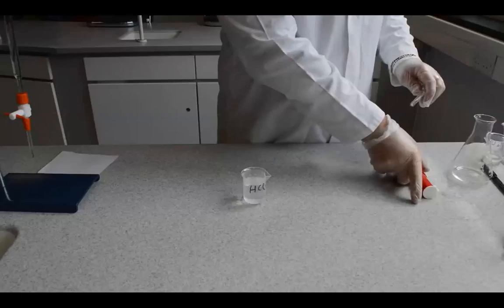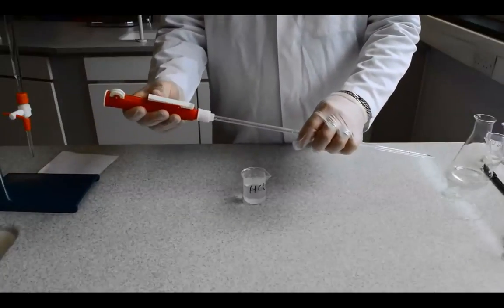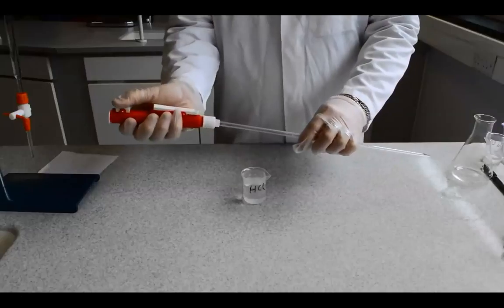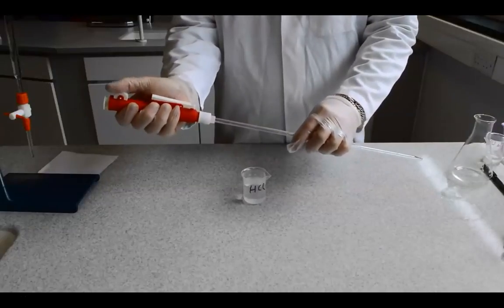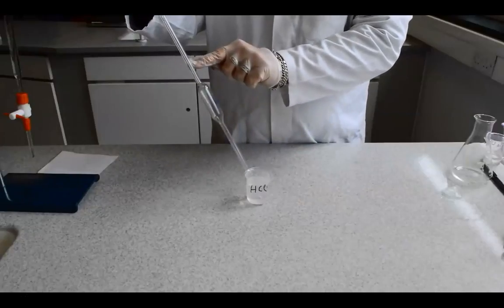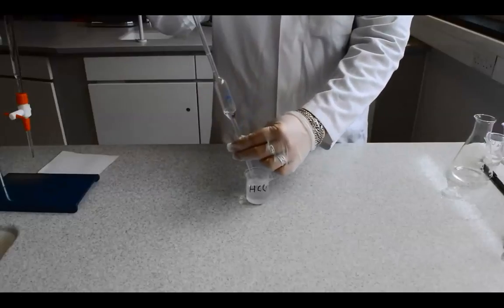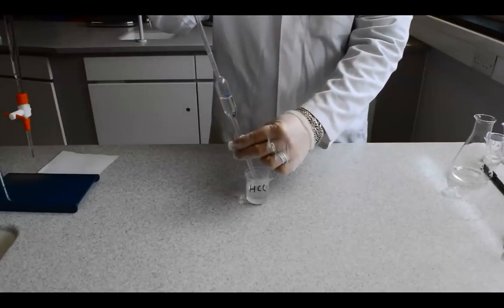Here's a demonstration of its use. He's showing here how the wheel is rolled to draw the liquid up into the pipette. Pointing now to the mark that indicates exactly 25 milliliters. So using the wheel, the liquid is drawn up to the mark.